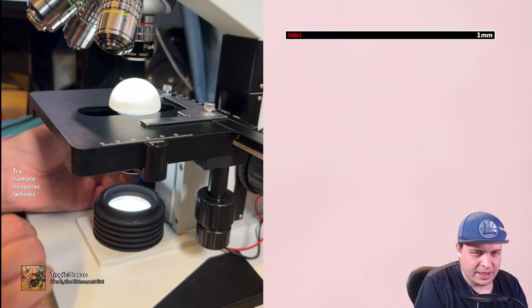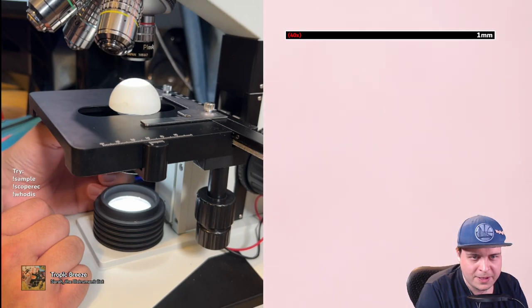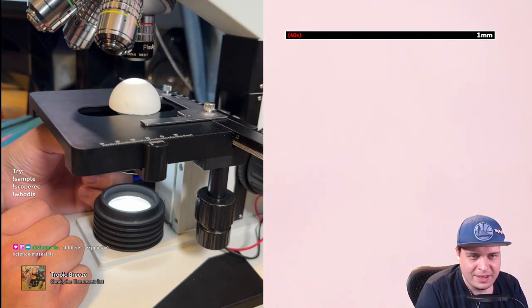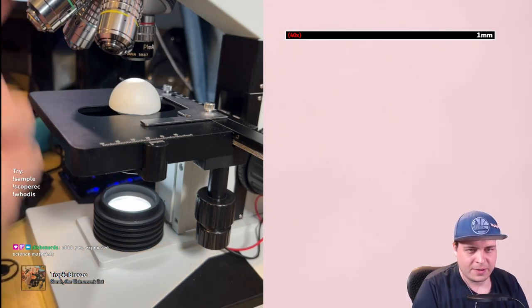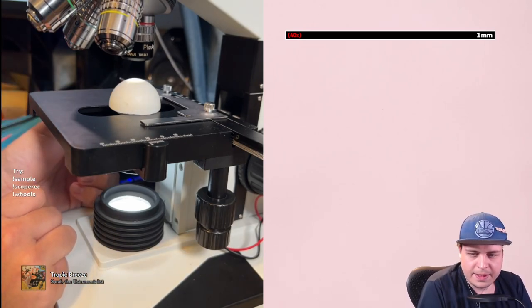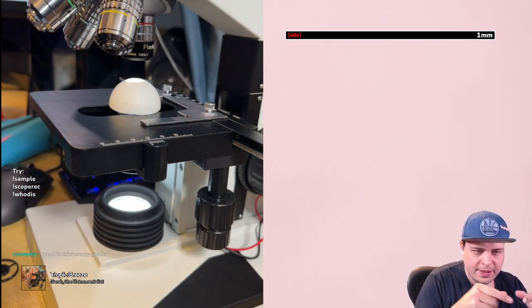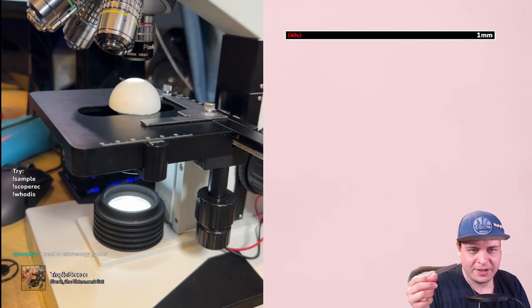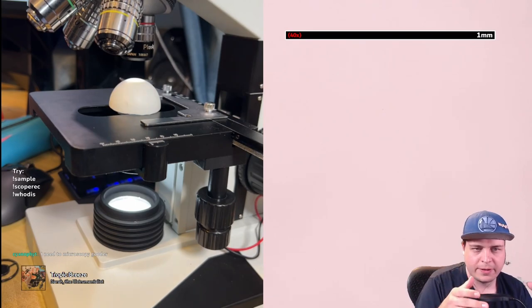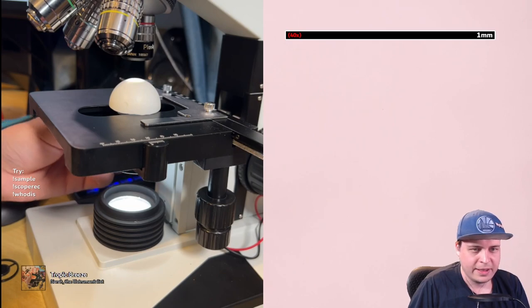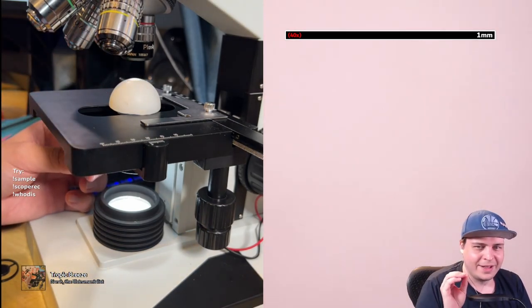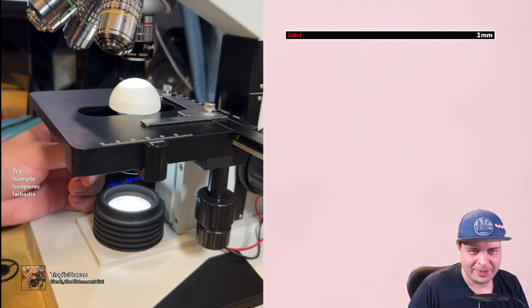I'm going to open and close the iris so you can see what's going on with the light field. As I open and close the iris, I'm opening and closing a cone of light that's going to hit the specimen. This idea of an obscuring circle that gets smaller and bigger in a two-dimensional plane translating into an angular difference in condenser light is super important for understanding microscope optics at a high level.